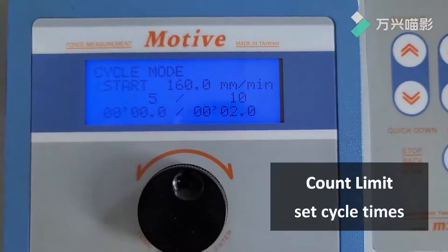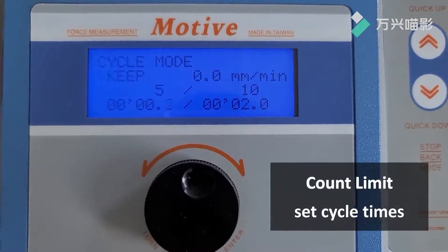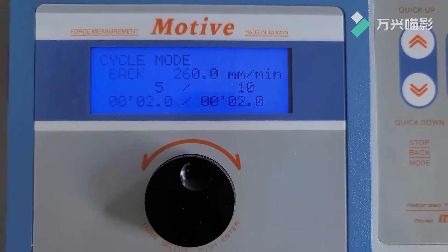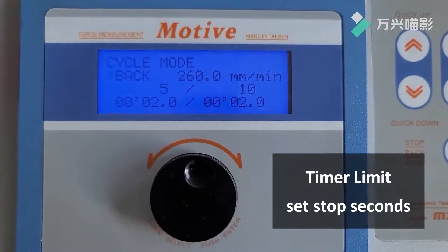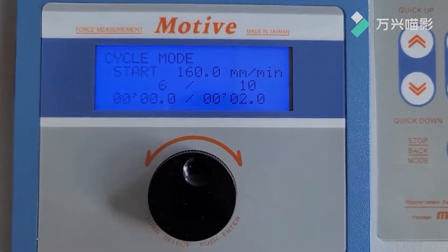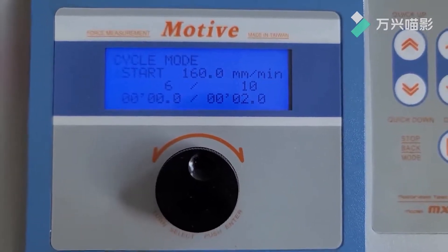Counter Limit Set: 10 times. Current number of cycles is 5. Time Limit Set: stop for 2 seconds. After the test is finished and stopped for 2 seconds, return at return speed.